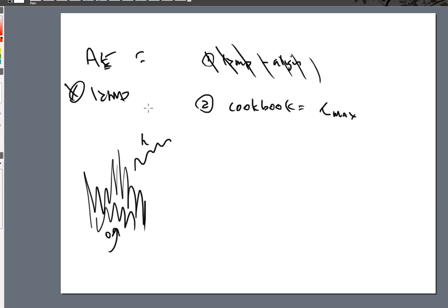So we still have to go to a cookbook, we still have to go to Lambda Max, and we still have to go to slit. And the reason is because these are really for monochromator pieces. They're not necessarily meant for the lamp pieces. So we are not using a lamp. We don't have to double check wavelengths and slit width and things on the particular lamp that we're using because there's not one installed.